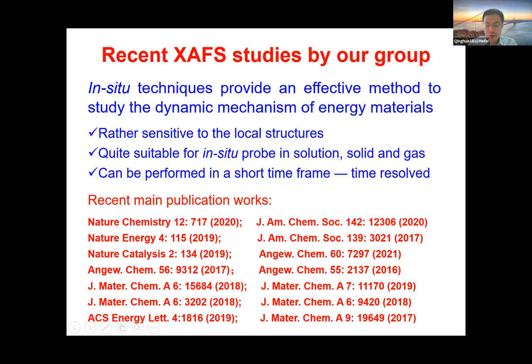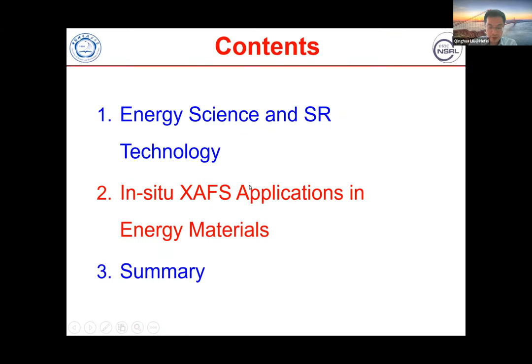In recent years, our group performed a series of in situ studies on catalytic reactions of advanced energy materials based on in situ surface techniques and achieved a lot of interesting results. Now, in the second section, I will introduce several typical research studies of in situ XAFS applications in energy materials in our group.